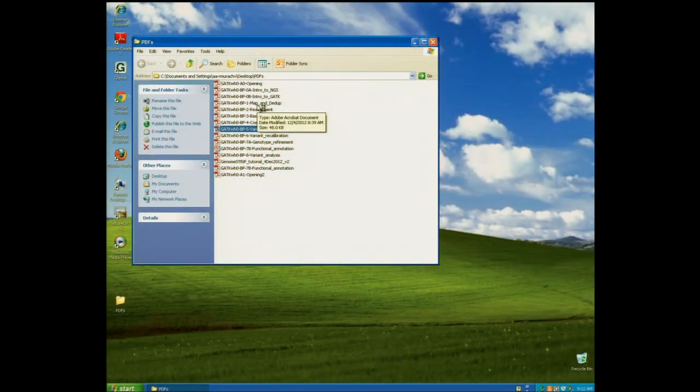So basically, all of the topics that we covered yesterday were how to get from your very raw data at the output of your sequencer to an analysis-ready BAM file. Yesterday, we covered topics like realignment and base quality recalibration, and all of these steps that get you a BAM. So what do you do now with the BAM? This is the topic that we're going to talk about today.